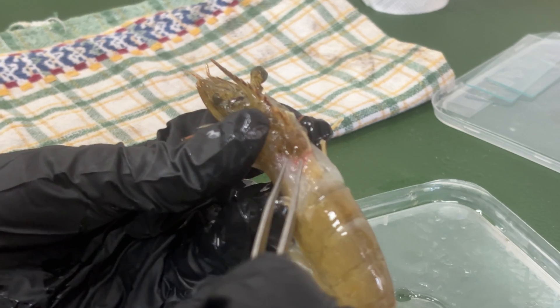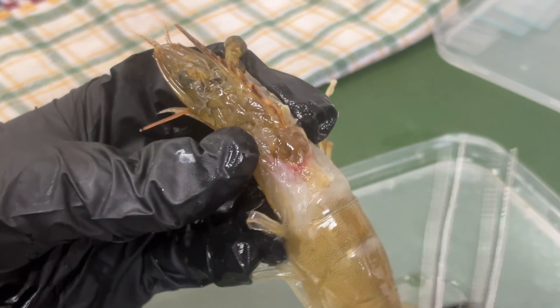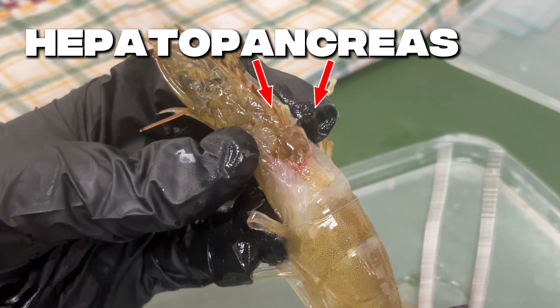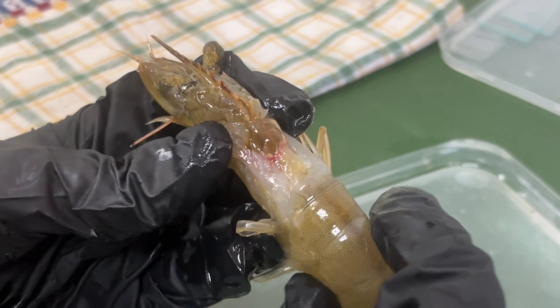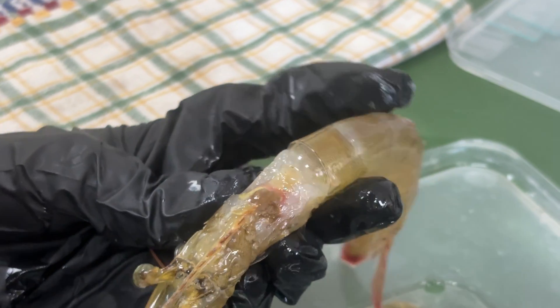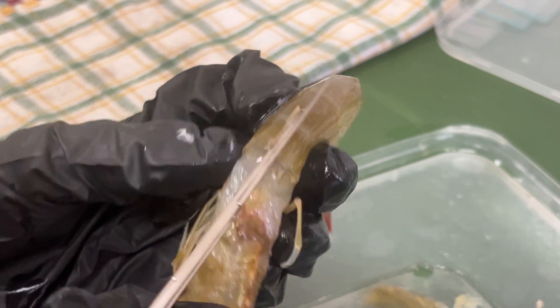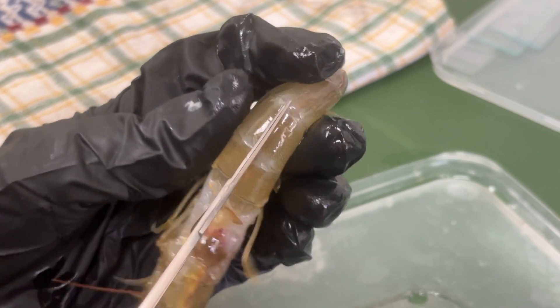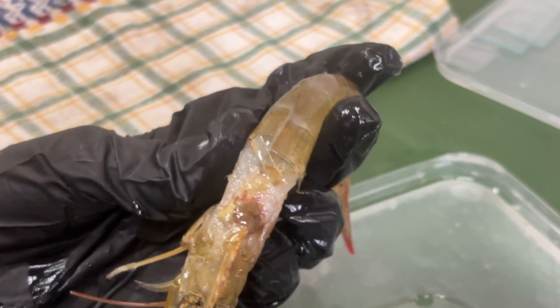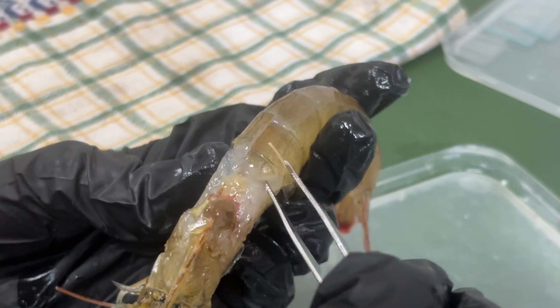This is the hepatopancreas, also called the shrimp liver. It is a yellow-orange paste that aids in digestion and nutrient storage. In cooking, it's often known as shrimp tomalley or shrimp fat for its rich flavor. The hepatopancreas is not only important for digestion in shrimp, it's also considered a delicacy in Chinese cuisine for its rich, creamy flavor.